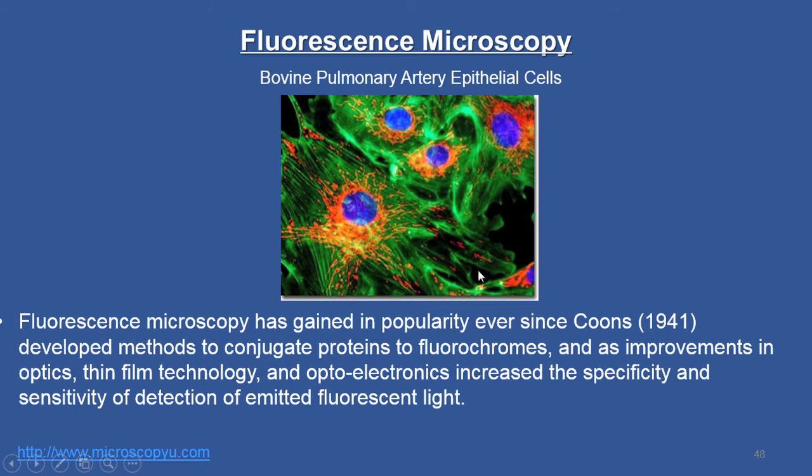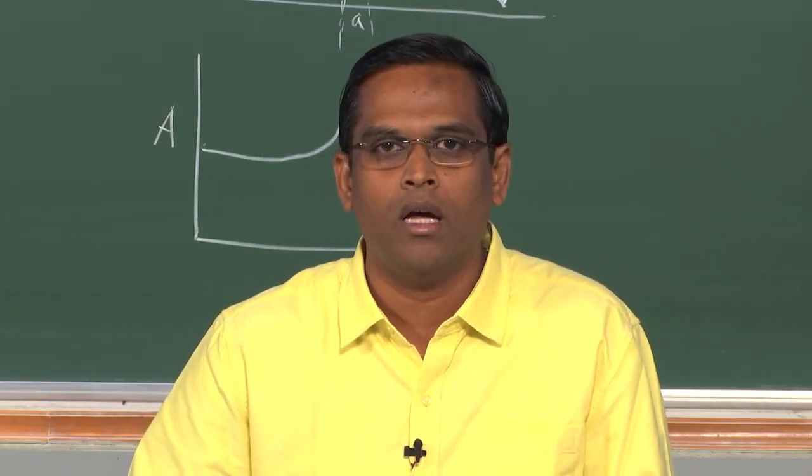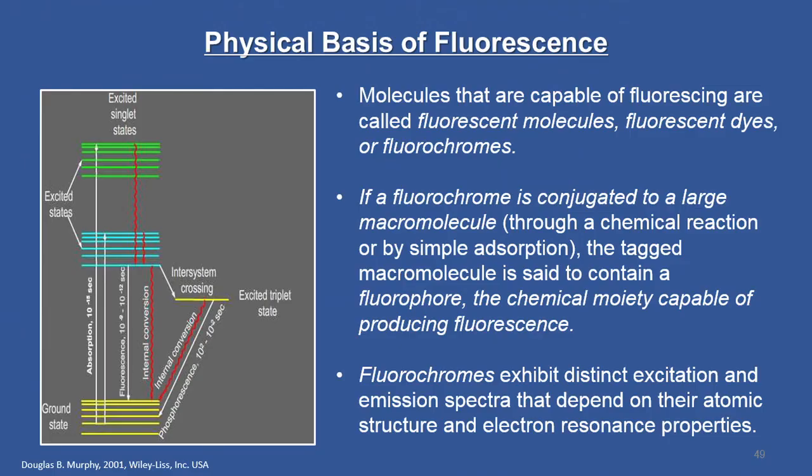We will see very briefly what are the principles of this microscopic technique. Mostly it is being used in biological samples and transparent samples and so on. We will now go through the principles and applications very briefly. So let us review the physical basis of fluorescence. I hope you have some idea about fluorescence, or you might have heard in your earlier classes.